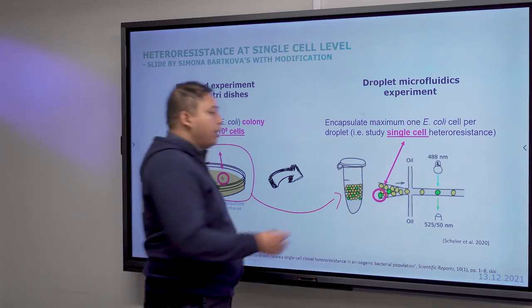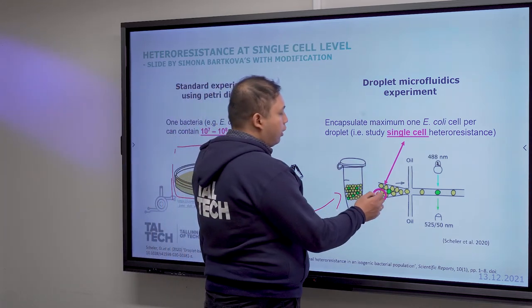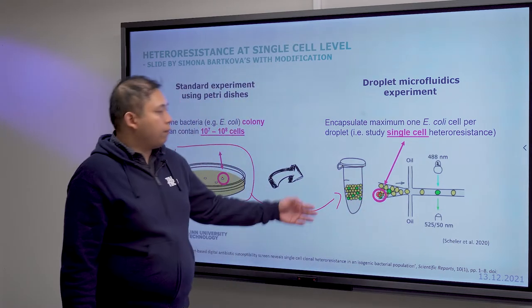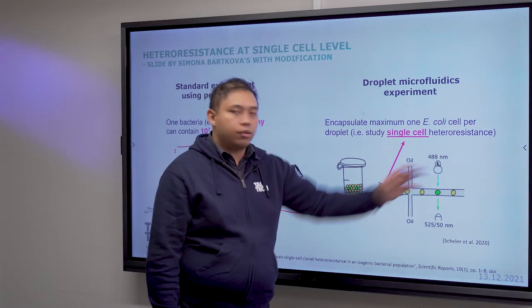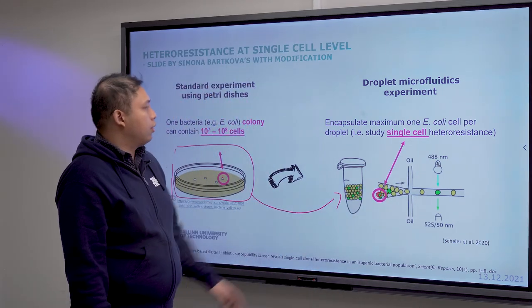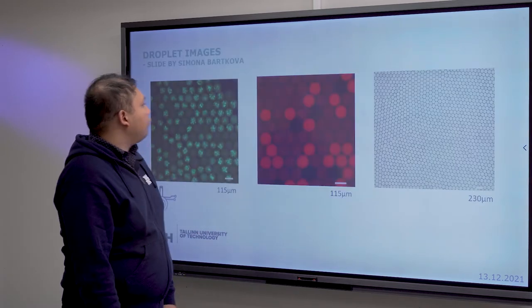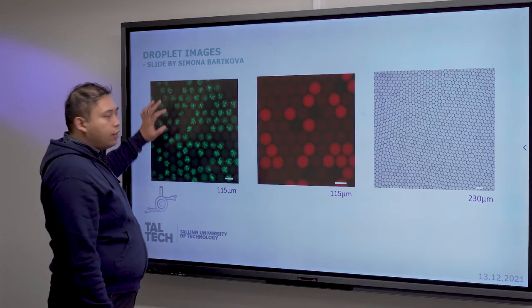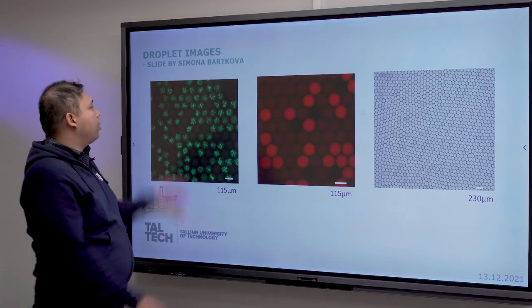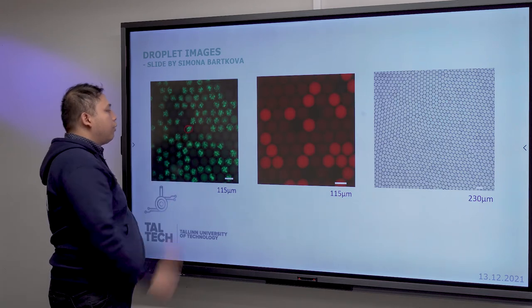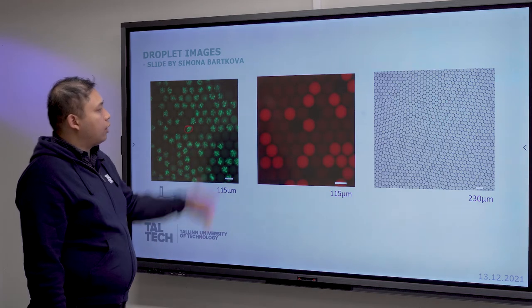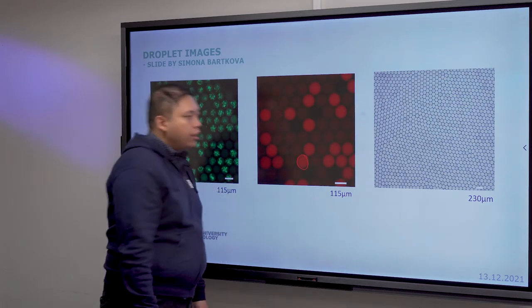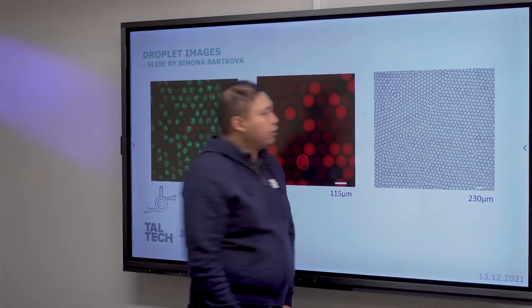Using this approach, we can encapsulate bacteria within droplets and see whether they grow or not. If bacteria grow, the droplet shows green fluorescence; empty droplets appear yellow. It can also be other colors using different dyes — for example a red dye — or just a bright field.